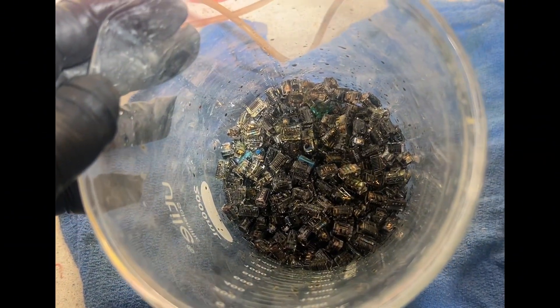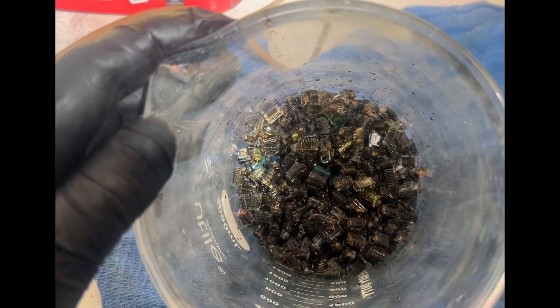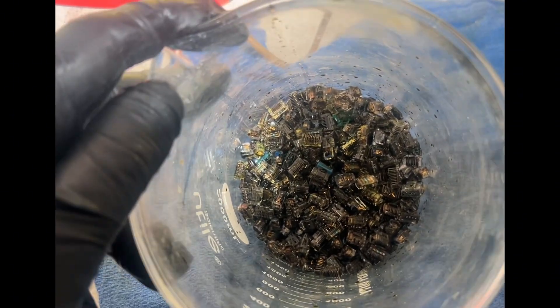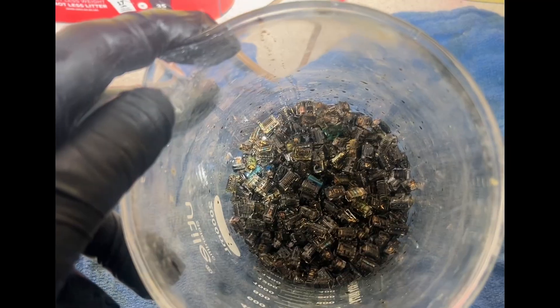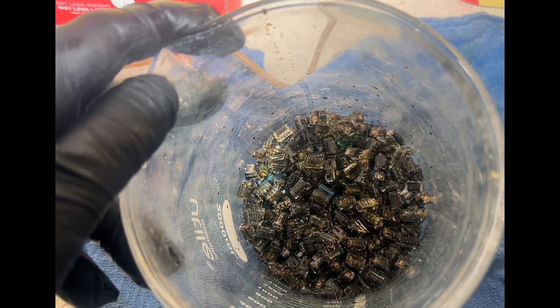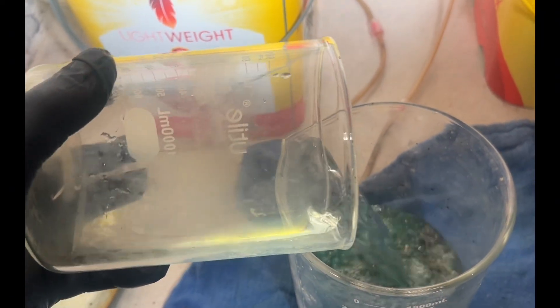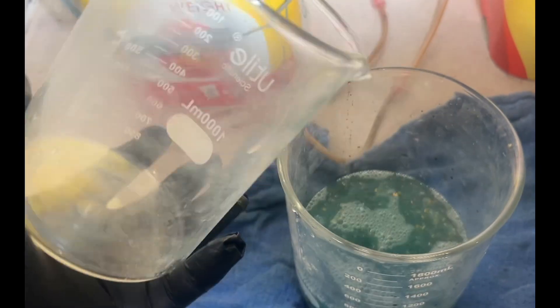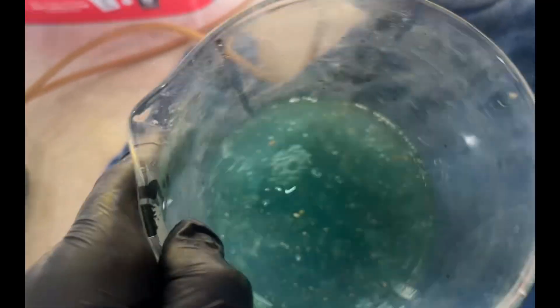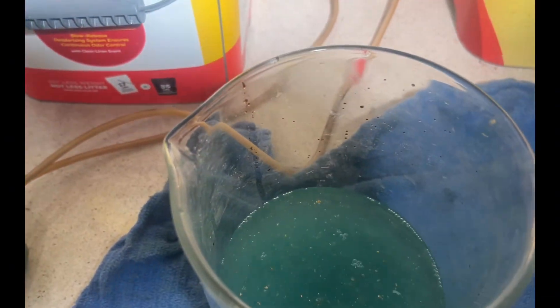Pardon the noise — the fume hood's on. I think we've dissolved most of the base metals. We're going to put a little water in here and stir it around to see how the foils float and get a general feel for how it's going. This here is just recycled rinse water. It doesn't look very much done — just stir it around and see how that works out.